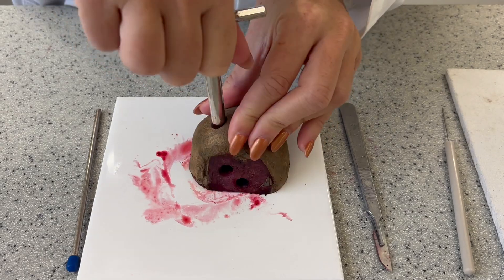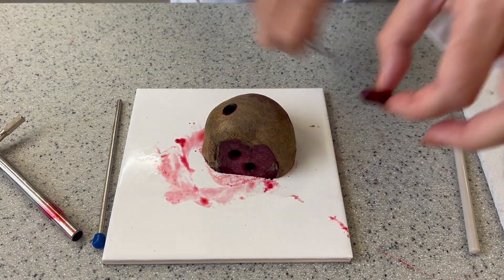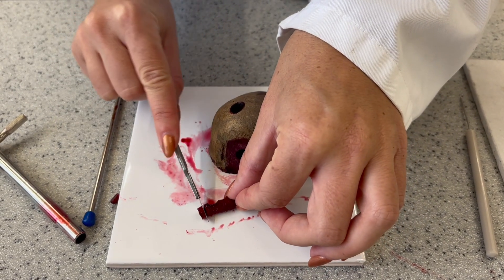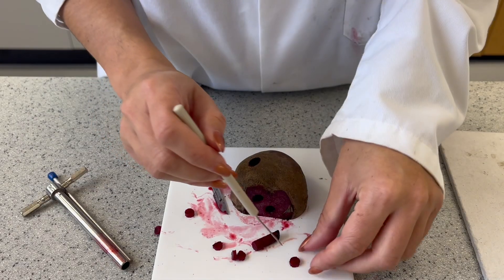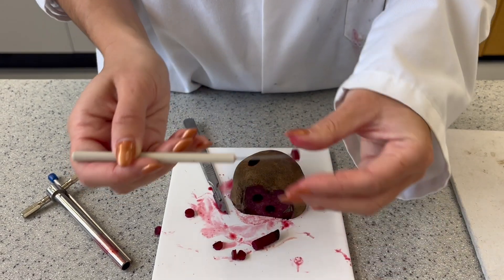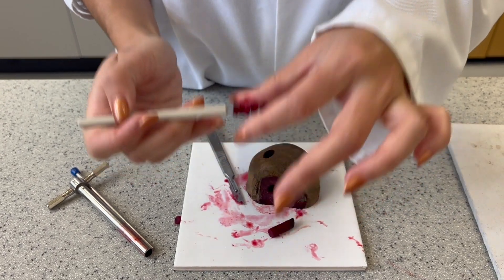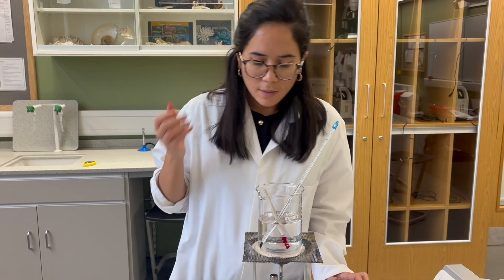Using the cork borer, we're going to take thin disks, making sure we don't include the skin. I'm going to pop them on a mounted needle and place them in our beaker.